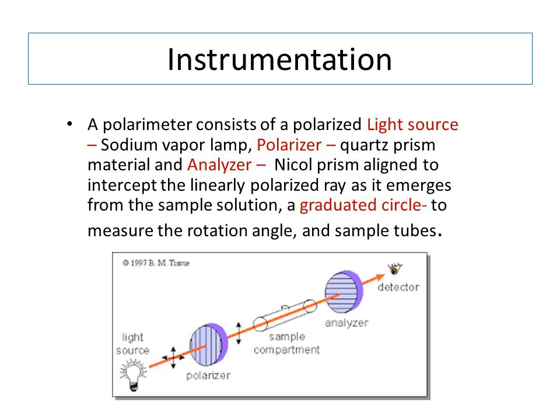Okay, so it's very important that this sample compartment is filled with your sample made up in its liquid, usually in water, and that there are no air bubbles in this. And it's also important that the glass windows at each end of that sample compartment are clean. So you can clean them with lens tissue if there are any fingerprints or dirt on them. And then that goes to the detector.